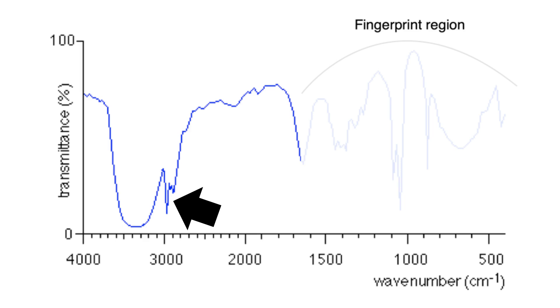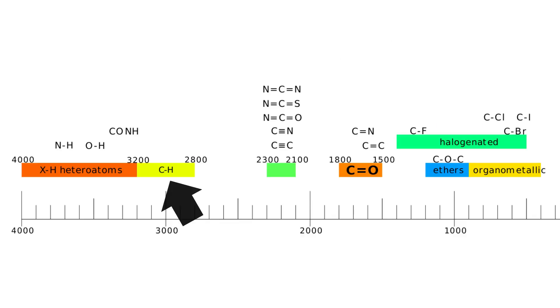The first peak is located around the 3000 mark. If we check that location from our correlation table we observe that this corresponds to a CH group.